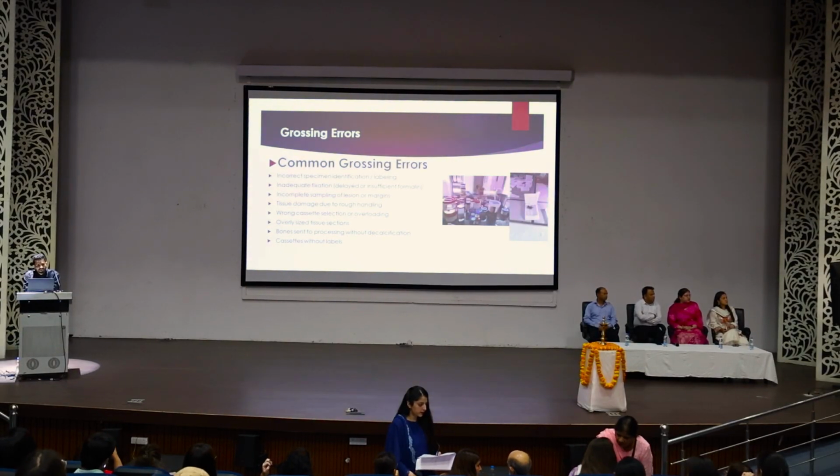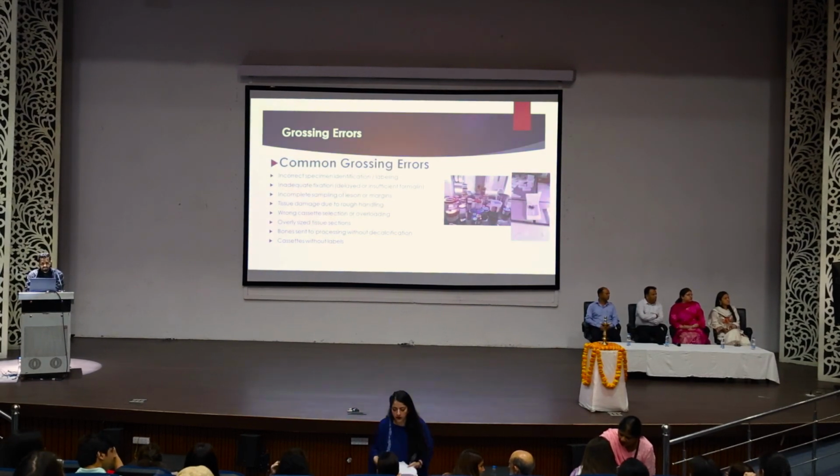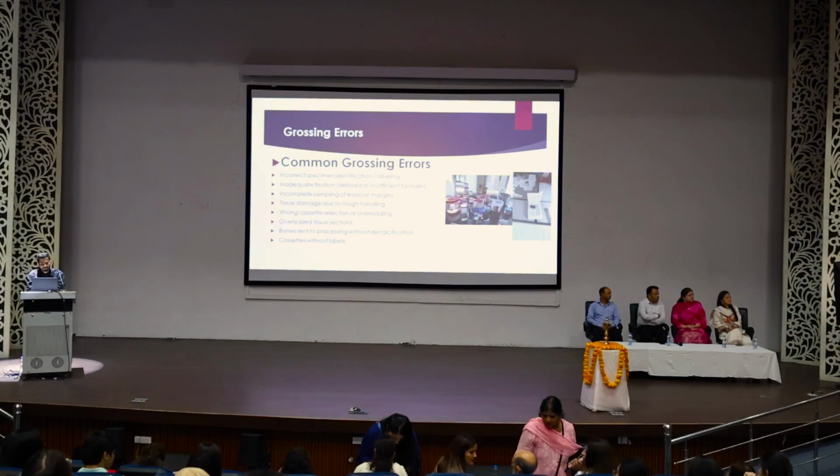Incomplete sampling of lesion margins. You need to completely sample the margins of tissue to allow better reporting. Tissue damage due to rough handling. You do not need to be rough with the tissue, as rough handling may damage the tissue. Wrong cassette selection or overloading.